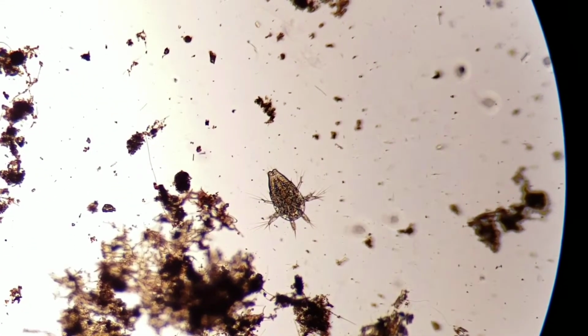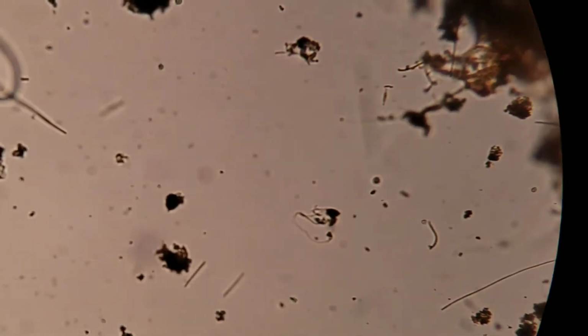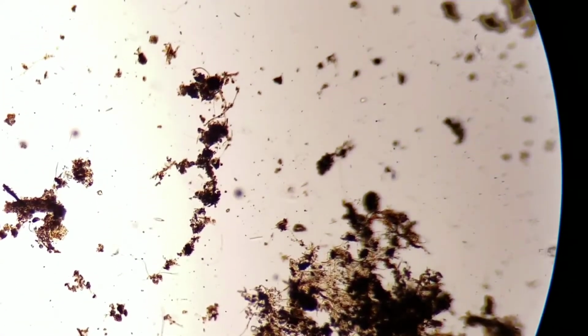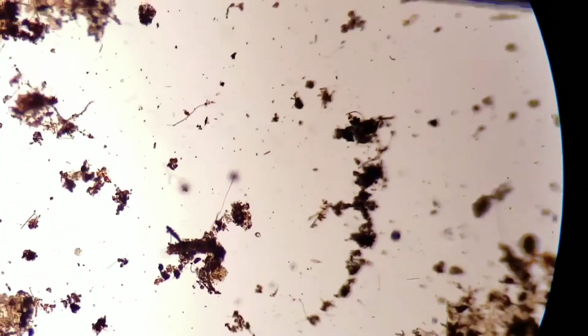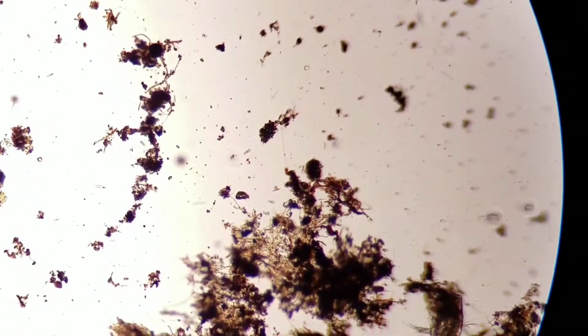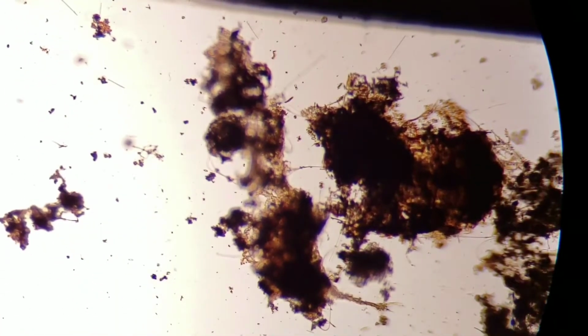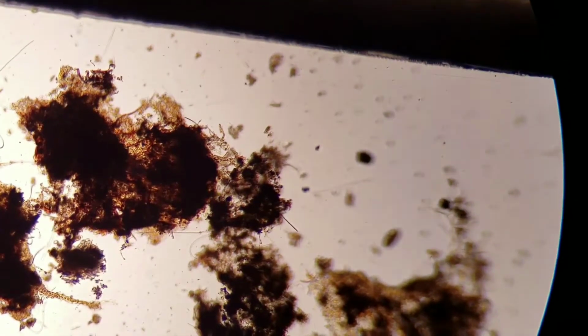And right away on this next slide, found a Cyclops. Where'd he go? It's hard with the phone. Let me see. It's my eye. Didn't just lose them, but they are fast. Took off. We'll see him again. It wasn't a fully developed Cyclops. It was young. They molt their skin, and each molt, they look a little different until they reach their adult form. Maybe we'll see an adult one in here.